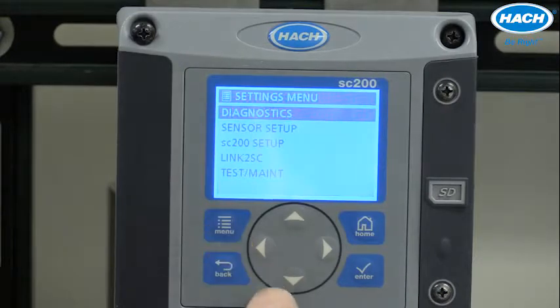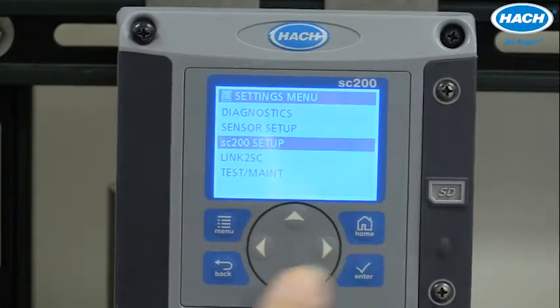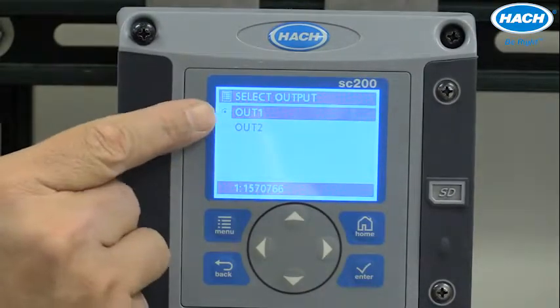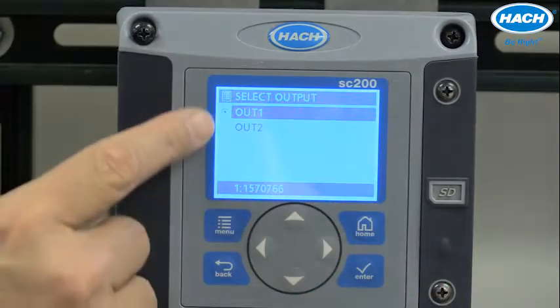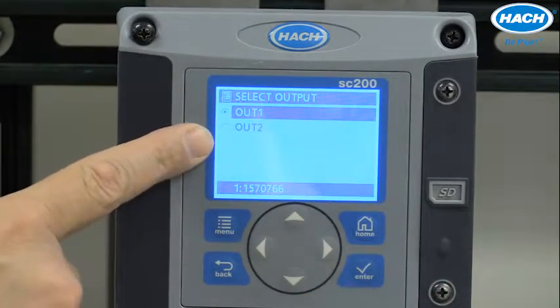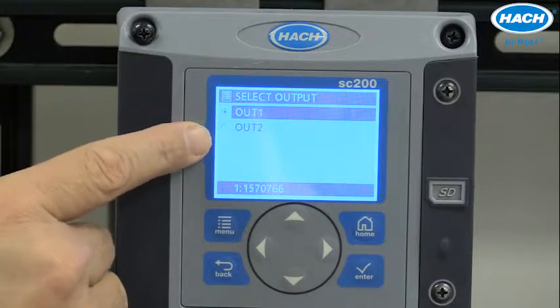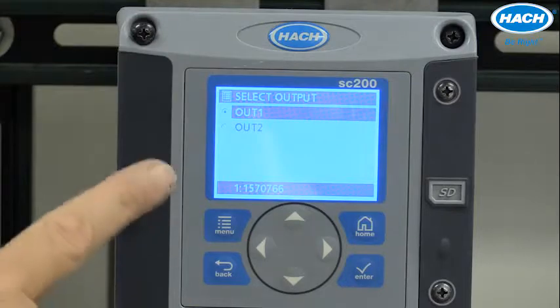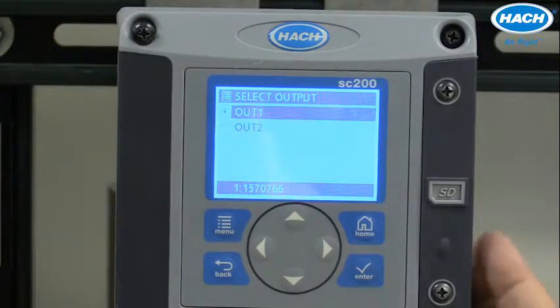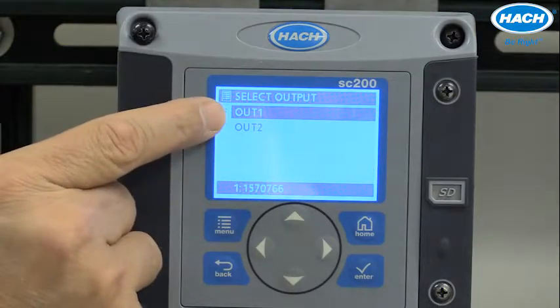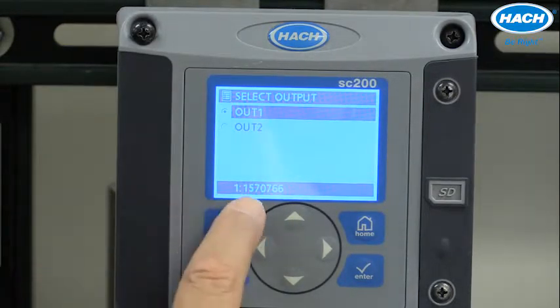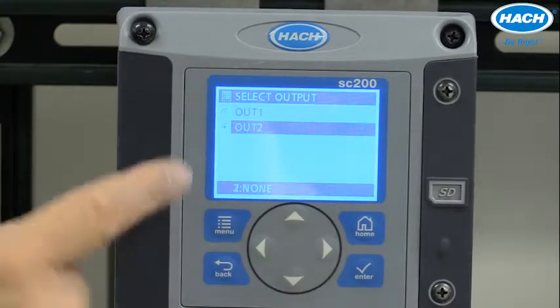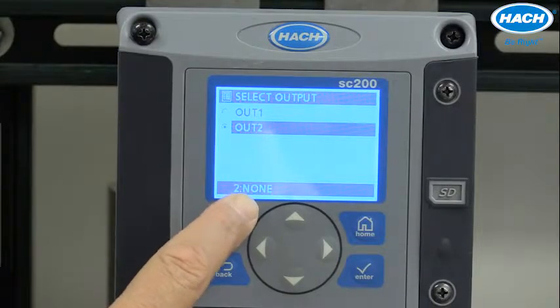We start the process by pressing the menu key and scrolling down to the SC200 setup menu. The output setup is one down, and by default every SC200 includes two 4-20mA analog output devices. An additional three outputs are available by purchasing an optional card which can be loaded inside the controller. Notice Output 1 is pre-configured by default to the serial number of the TU5300 in use. Output 2 is currently not set to any source.